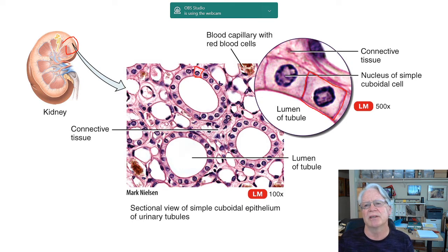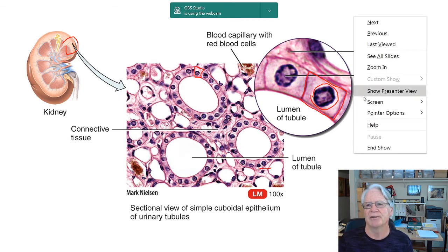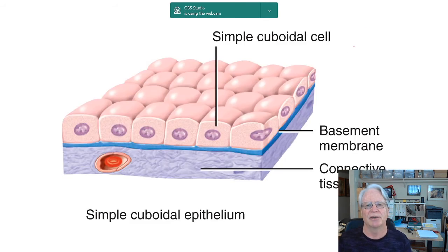Okay, and look at that nucleus. Look at that big oval nucleus. It's taking up a lot of space inside that cell. This is typical for this type of tissue. You can see it all around here. This kind of reminds me of a bracelet, sort of, with little stones that encircle the wrist. That's kind of the way I look at it. Not a very pretty bracelet, but nevertheless, you get the idea.